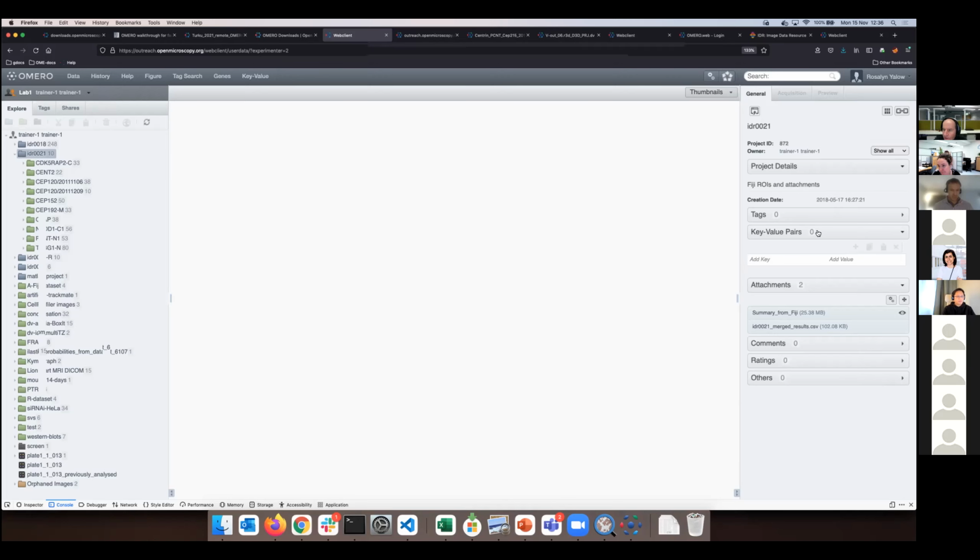We have Jean-Marie's notebooks which are able to do the analysis, and we can show them tomorrow. But this is how the analytical results can be stored. So 2 ways: under the attachment, Omero Table or a CSV.